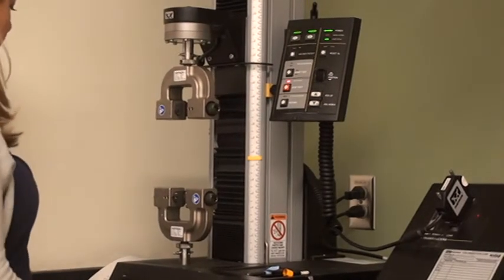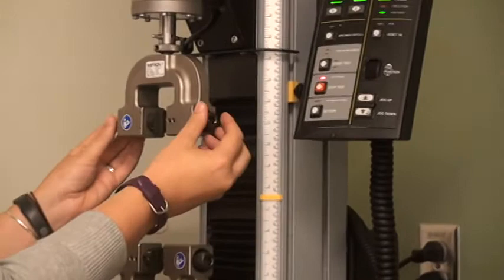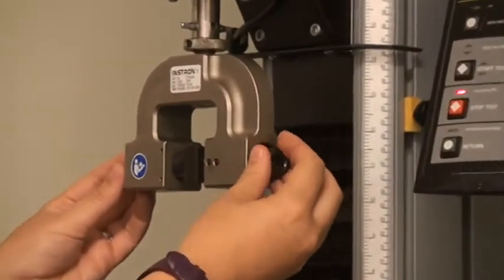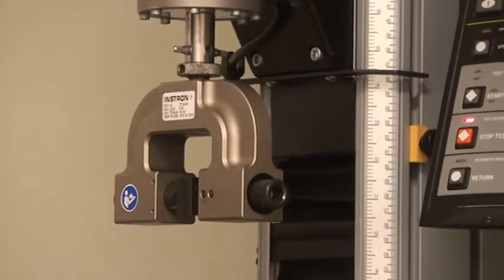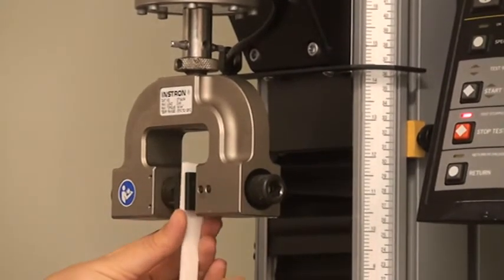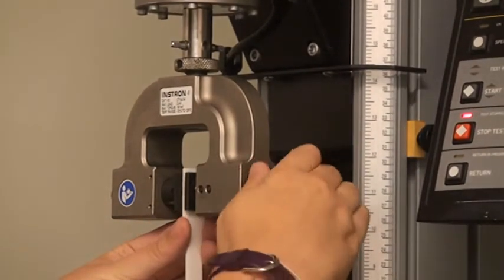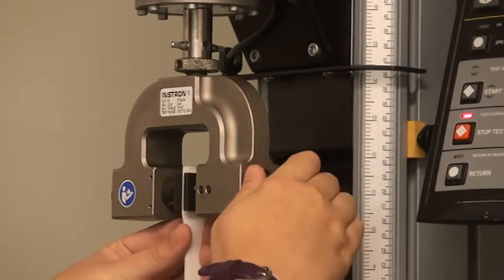Starting with the upper grip, use the screw knobs on the side of the grip to separate the jaw faces until they are a little bit further apart than the thickness of your sample. Insert your sample into just the upper grip and tighten the screw knobs to grip your sample.